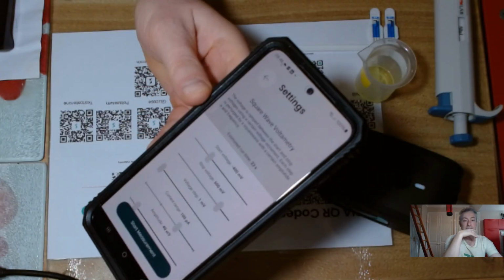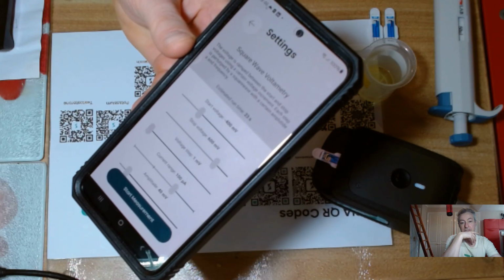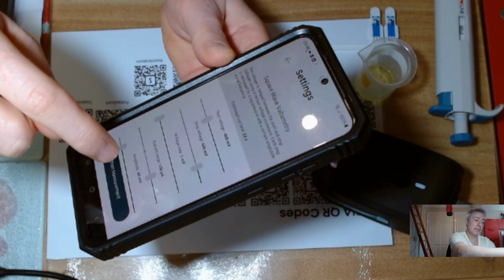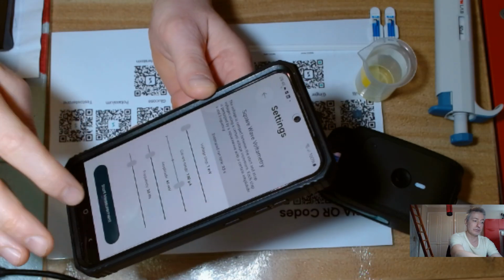I'm going to start the experiment at minus 400 millivolts. I'm going to go to an end potential of 600 millivolts. My voltage step is 1 millivolt. My current range is 100 microamps. My amplitude is 40 millivolts and my frequency is 30 hertz.